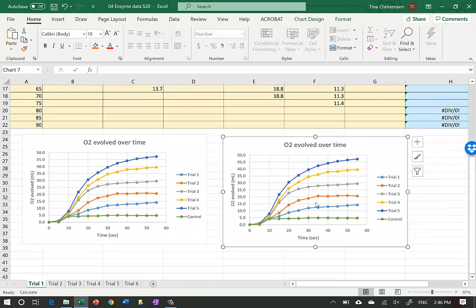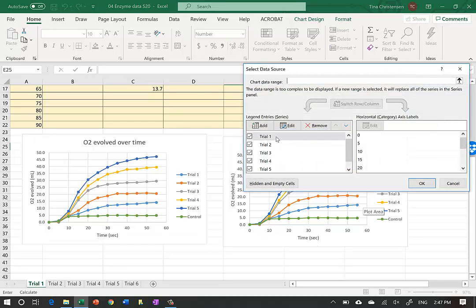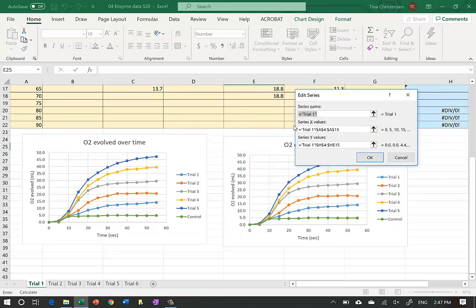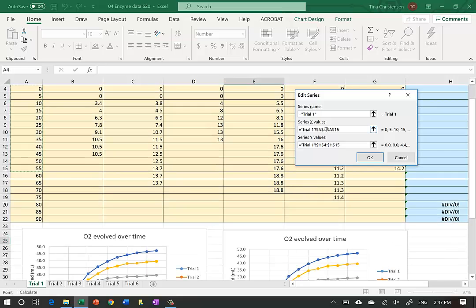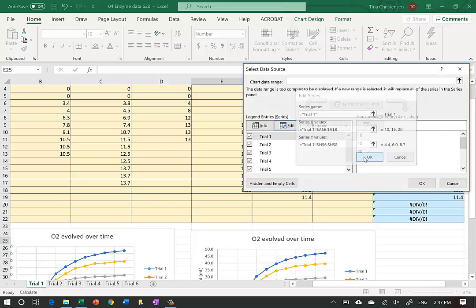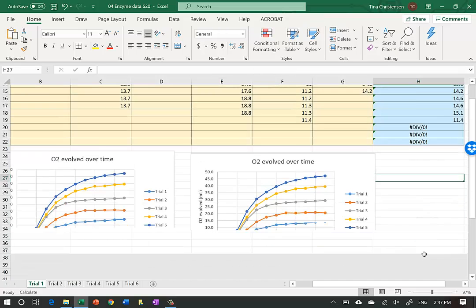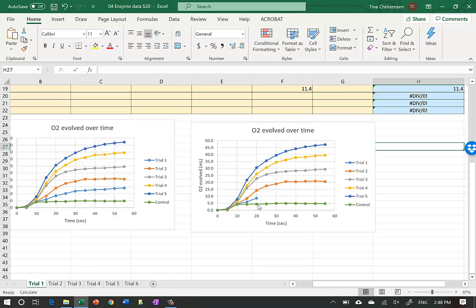We click on the second graph, right-click, go to Select Data, and edit each series. Where it says rows 4 to 15, we want to change that to rows 6 to 8. I go back and change the start to 6 and the end to 8. Row 6 is time 10 seconds and row 8 is 20 seconds. We do the same for the Y values - only graphing from row 6 to row 8. We can see Trial 1 now goes from 10 to 20 seconds.